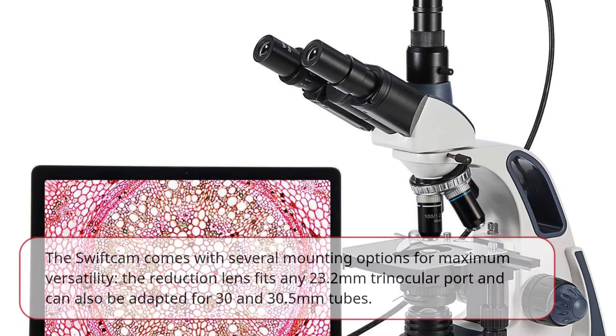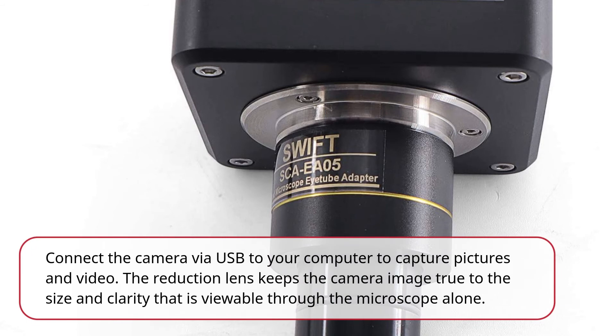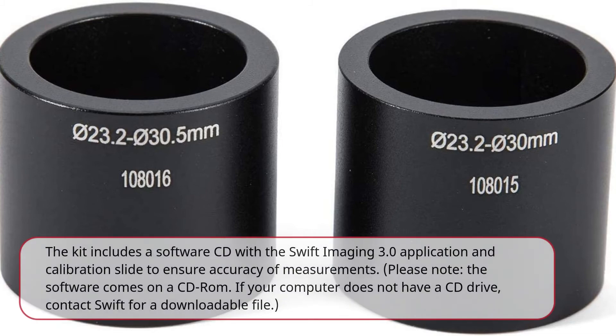The SwiftCam comes with several mounting options for maximum versatility — the reduction lens fits any 23.2mm trinocular port and can also be adapted for 30 and 30.5mm tubes. Connect the camera via USB to your computer to capture pictures and video. The reduction lens keeps the camera image true to the size and clarity viewable through the microscope alone. The kit includes a software CD with the Swift Imaging 3.0 application and calibration slide to ensure accuracy of measurements.